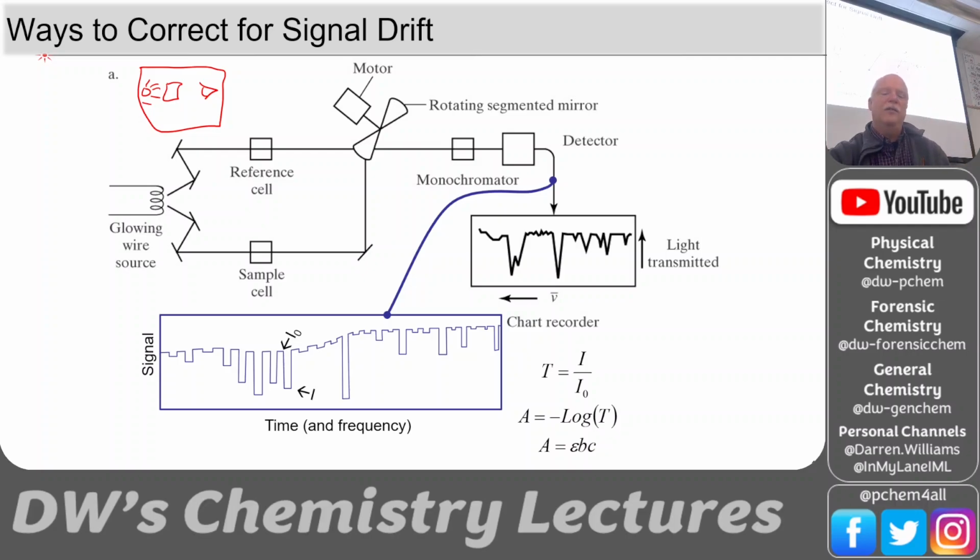We don't want drift. And so if we look down here, notice this top line is going along strong. Let's say the elevator is going, and then all of a sudden they reach the floor, and the power of the building comes back up, and now it's up here. You see how the signal's drifting? That's moving our baseline. And so that's changing all our blank signals and moving where we set it to 0 absorbance. That's a problem because now that's no longer accurate.